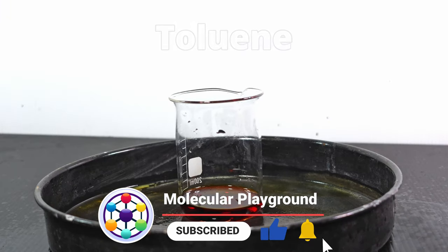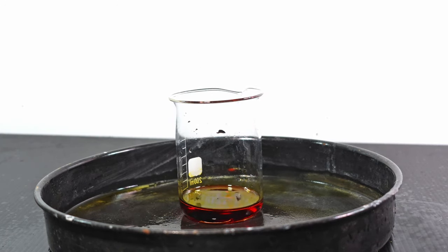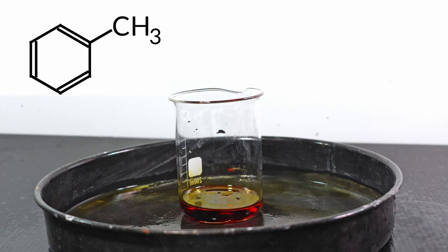For the fifth test, I react toluene with chromic acid. As you can see, nothing really happens. That is because toluene is just benzene with a methyl group.